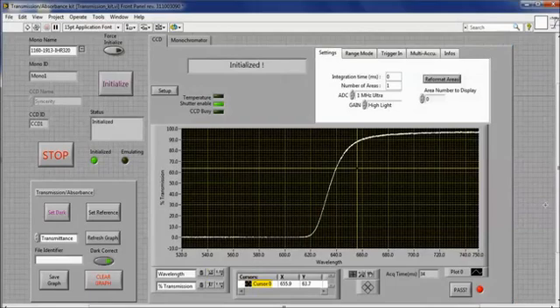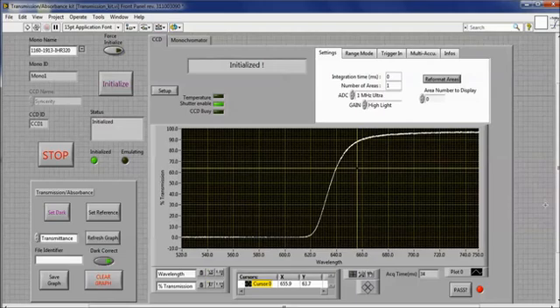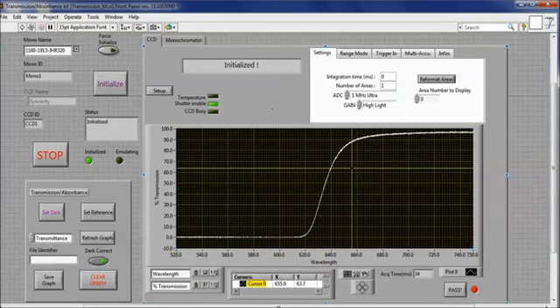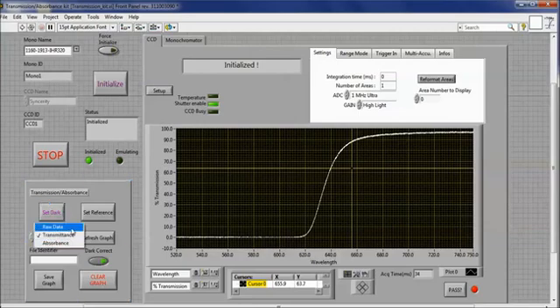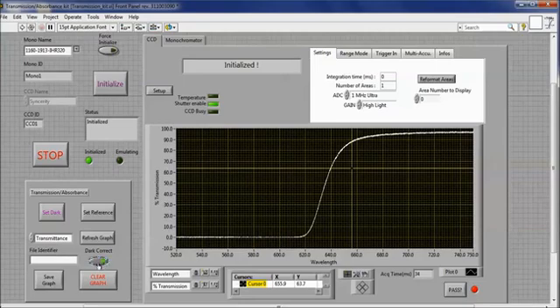Here is a piece of example code which was written to carry out a transmittance or absorbance measurement. In this case, an IHR 550 imaging spectrometer was interfaced with a Synapse CCD 1024x256 open electrode camera to record a spectrum of a 630nm long pass filter. All of the instrument controls are included within two tabs for the spectrometer and CCD. I have also included post-acquisition data processing — you can set a reference and a dark spectrum and then display your data as raw data, percent transmittance, or absorbance. In addition, you can turn dark correction on or off and save your results. This is just one example of specialized code that can be developed from our base-level LabVIEW VIs.